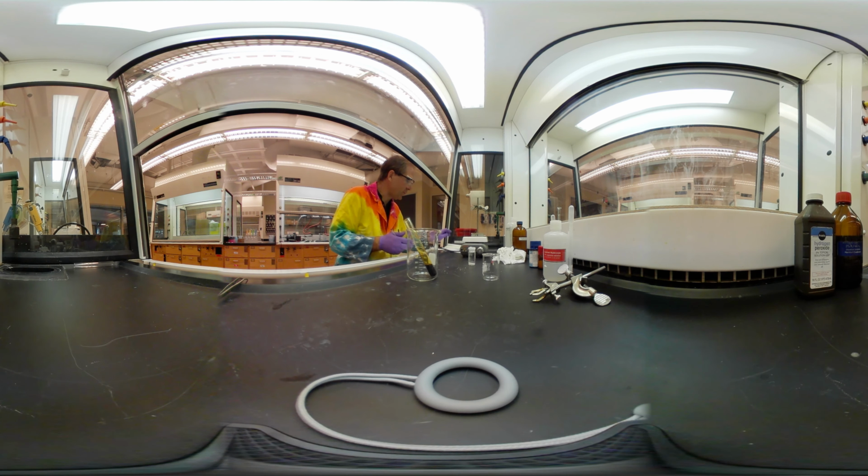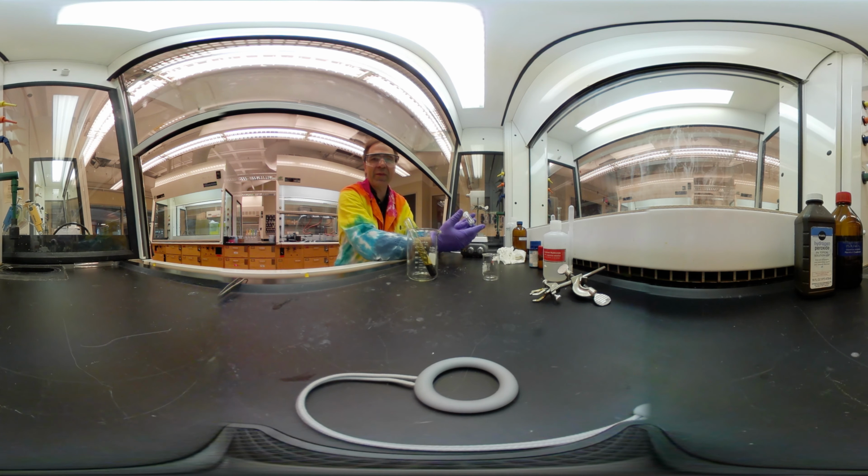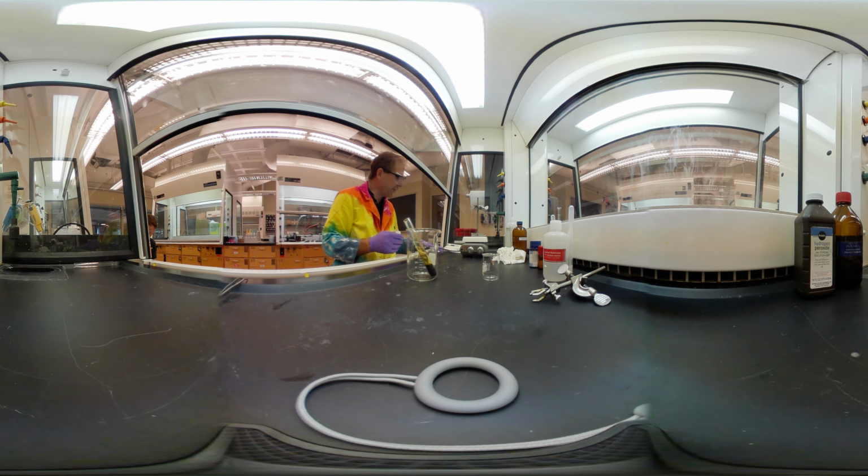Okay. All right, what do we add next to this? Next, we put in 2.5 to 3 grams. And I've weighed it out, and I will give you the data. But again, like I said, I often write my masses and things on the bottle when I'm there, or you can put it in your notebook. I'm going to keep track of it. So we're going to put in 2.5 to 3 grams of fresh sodium hydrosulfite dihydrate, Na2S2O4·2H2O.